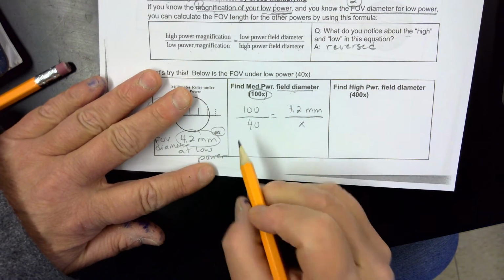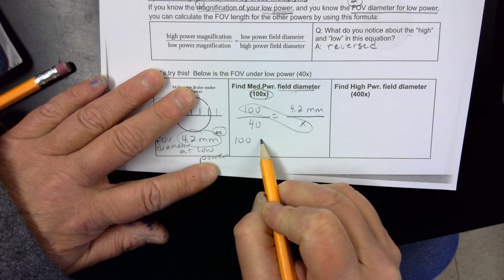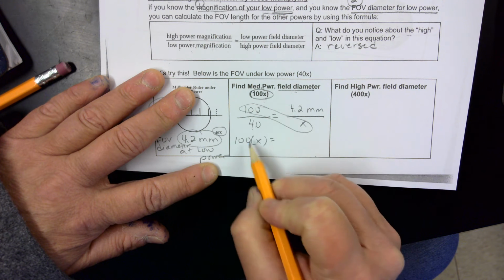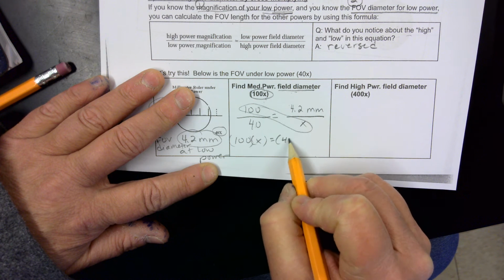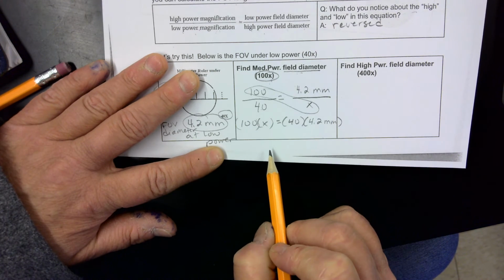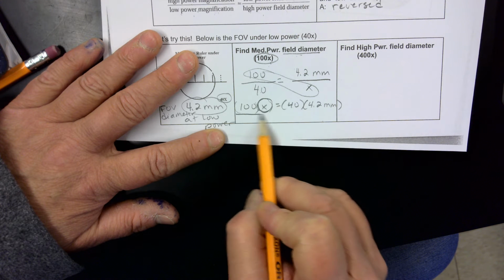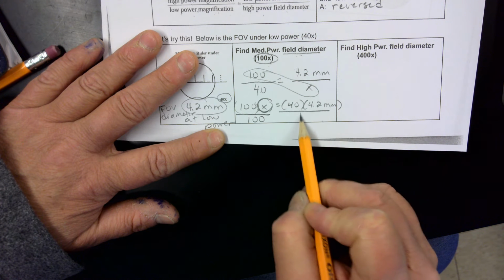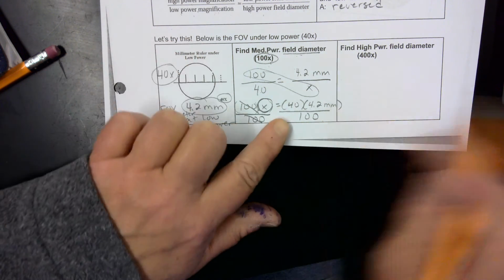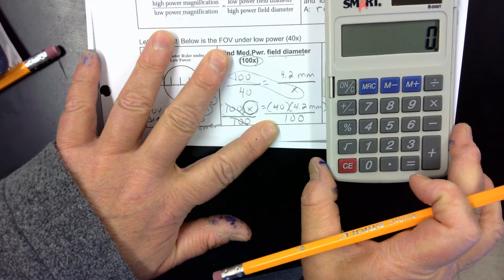Okay. So if we cross multiply, we have 100 times x is equal to 40 times 4.2 millimeters. We want x all by itself, so we're going to divide that by 100. The hundreds over themselves cancel out. And now we have the math to do in your calculator. So let's see what that looks like.